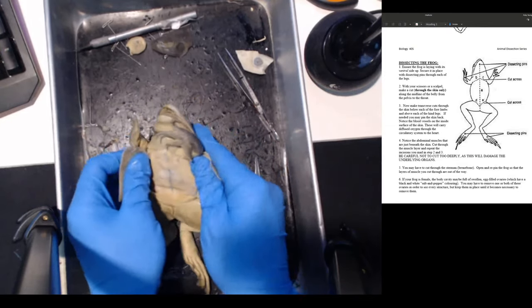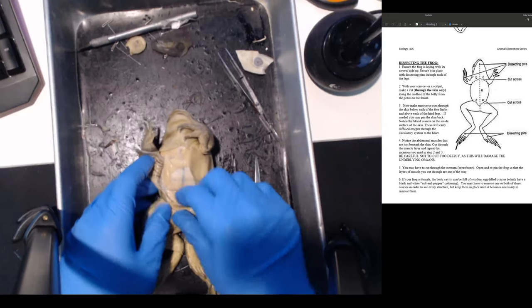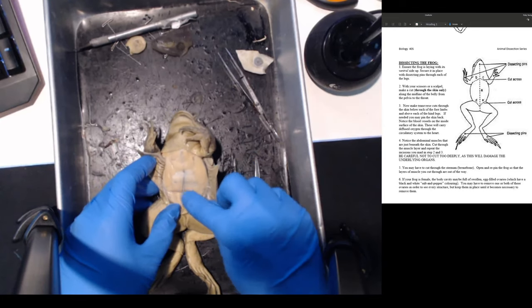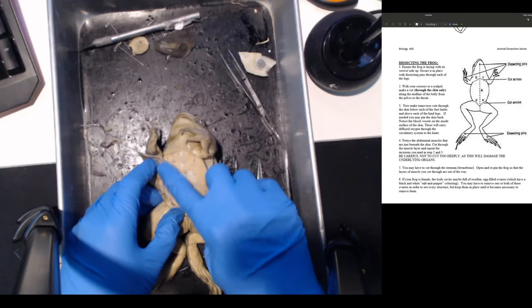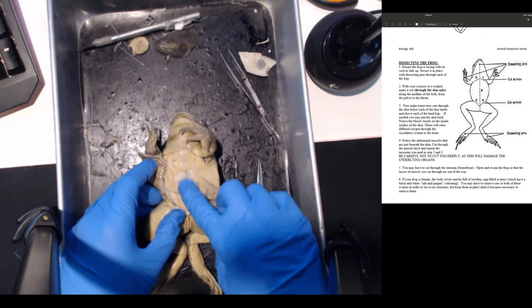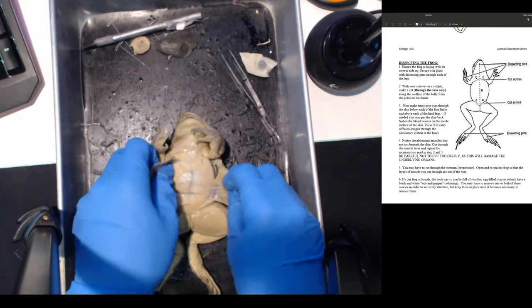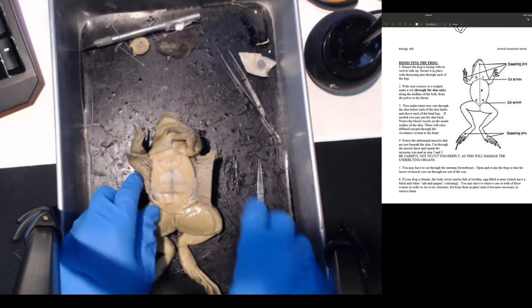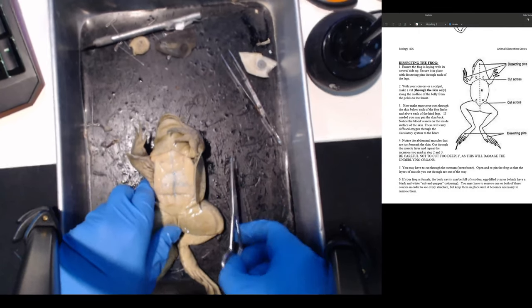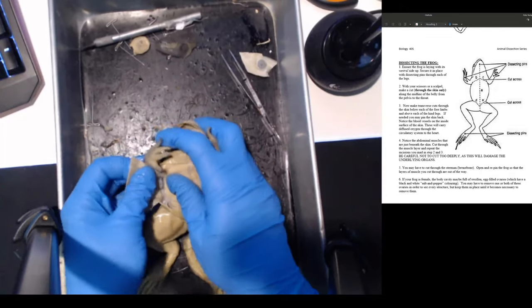Now that the skin is open you can see the muscles right here - this is like your abs. The frog has pretty strong abdomen muscles. These are all the muscles and you can see blood vessels that go along here as well. The smell is getting pretty strong once I start opening this up. Let me peel the skin back a little bit and make an incision to cut through the muscle layer.